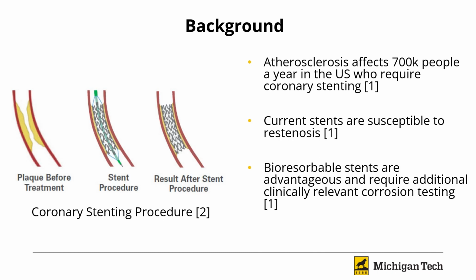The purpose of this design is to combat the issues associated with restenosis of current generation stents, as 700,000 people are affected by atherosclerosis each year and are required to undergo stenting.